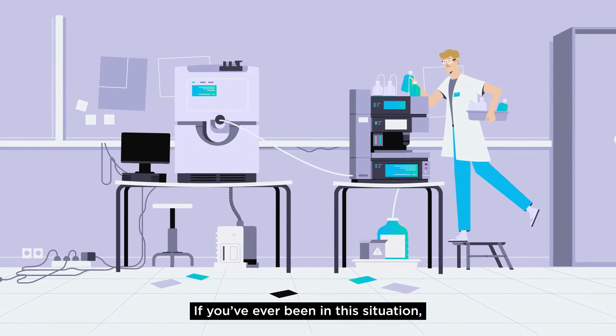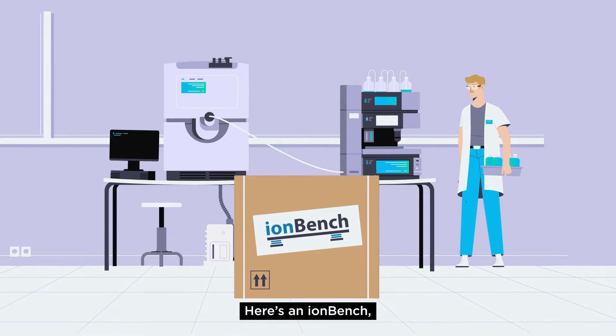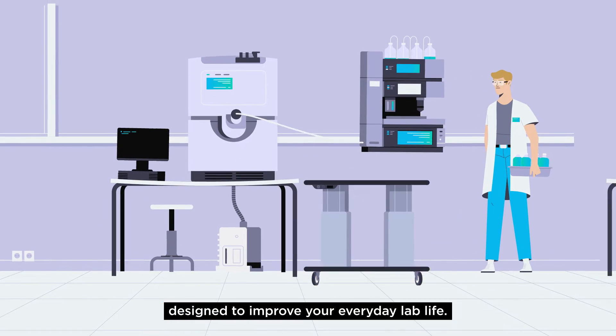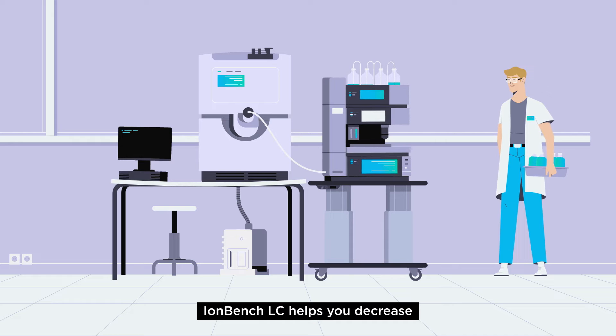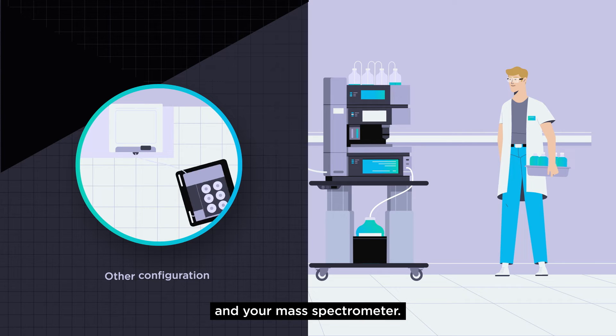If you've ever been in this situation, IONBench can help you. Here's an IONBench, designed to improve your everyday lab life. IONBench LC helps you decrease the void volume between your liquid chromatograph and your mass spectrometer.